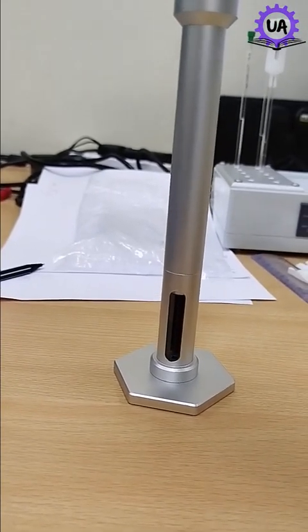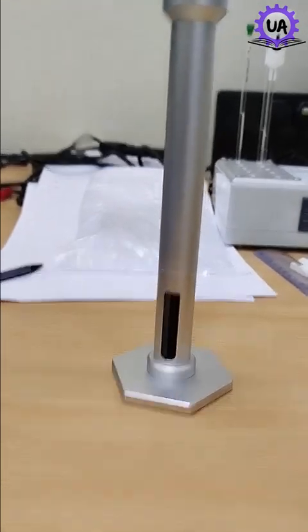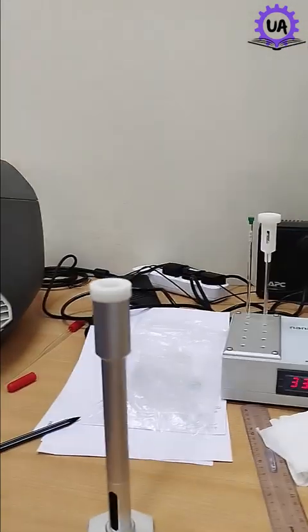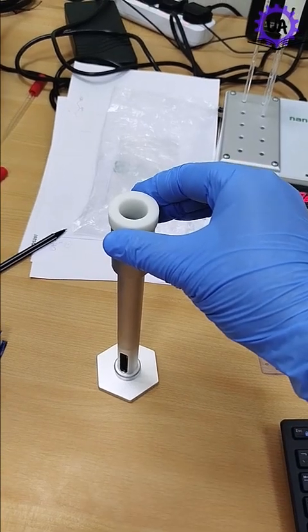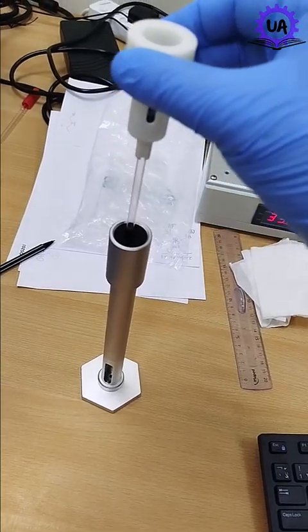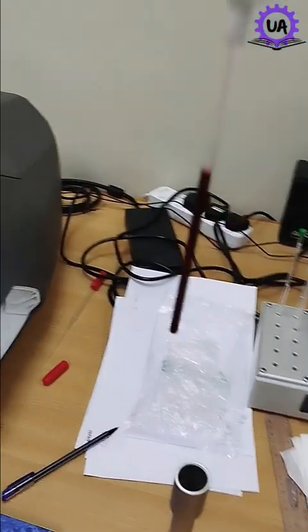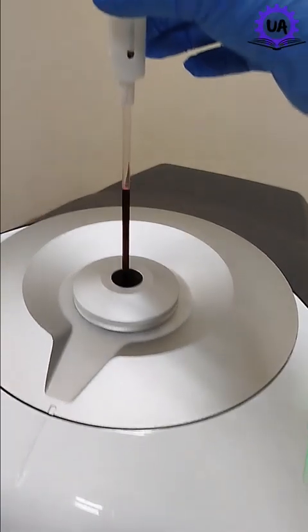Once it touches the base, take your hand out and grasp your sample from the sample holder and gently insert it into the machine.